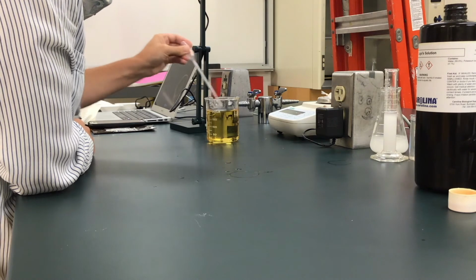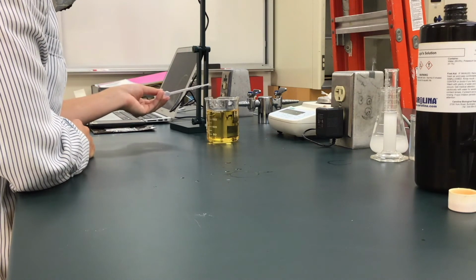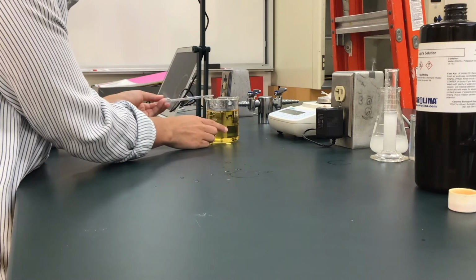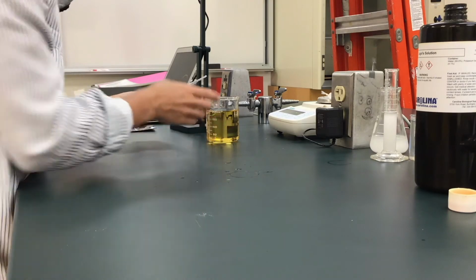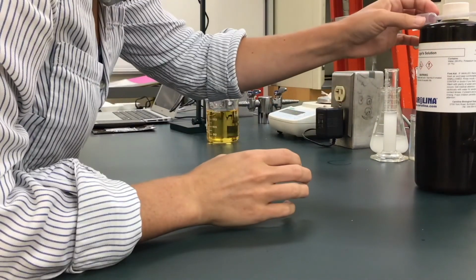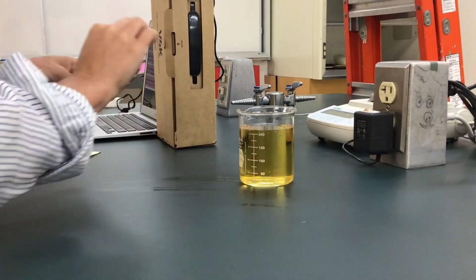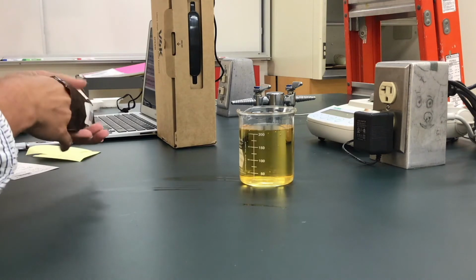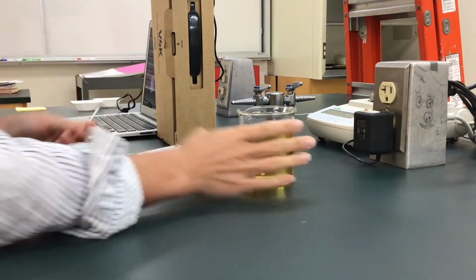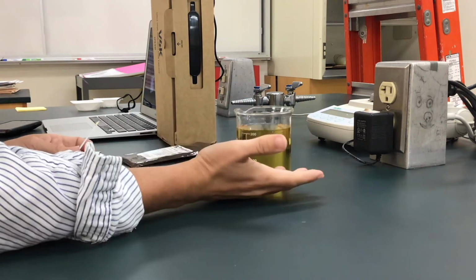If there was starch in this solution, we would see a blue color, but we don't. We see orange, which indicates to me that there's no starch in our distilled water solution. I'm going to close that. What we want to do is just make sure we get an initial concentration of glucose in our beaker before we put our dialysis tubing in it.